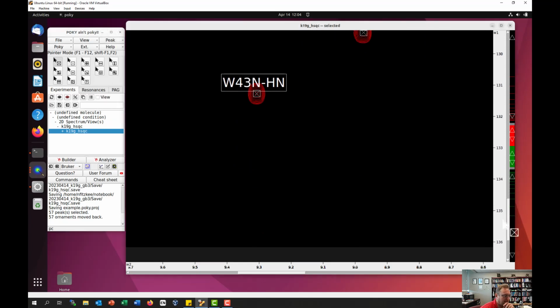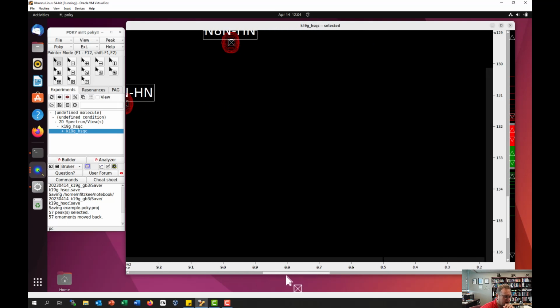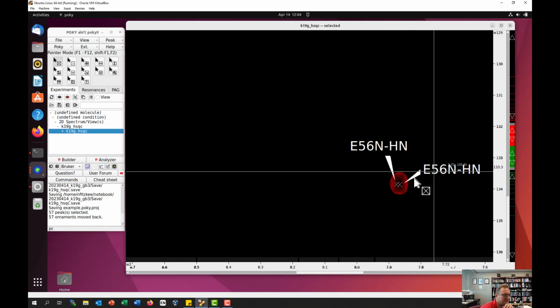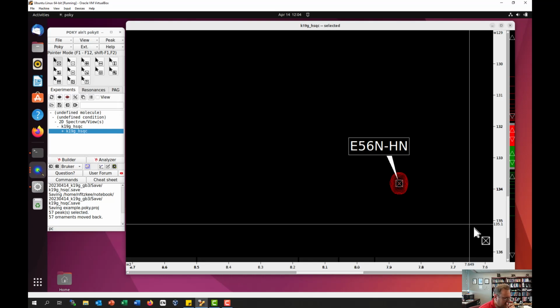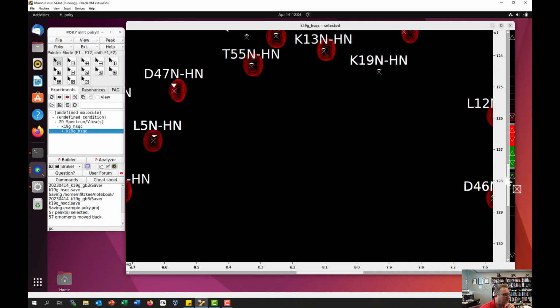So again, I'm already here at the bottom. I'm going to start at 8.7 ppm, so I'm going to move this so that 8.7 is now on the left-hand side. And notice that for whatever reason this has two E56s. We can get rid of that. And we'll select this, lowercase p, lowercase c. Again, starting from 8.7 and now snaking it back up.